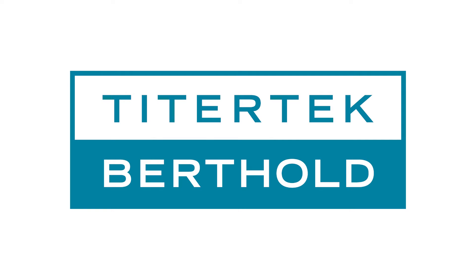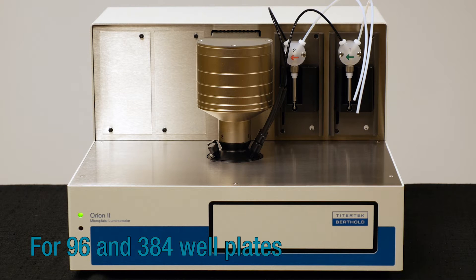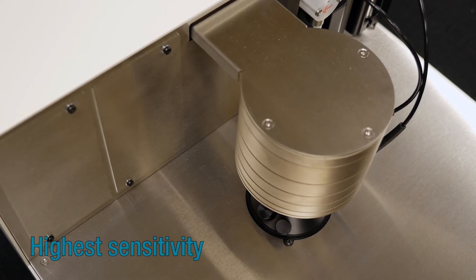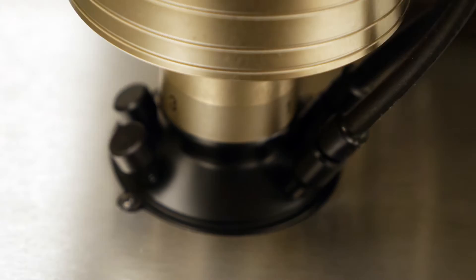Welcome to TiterTech Berthold. This is the Orion II microplate luminometer for 96 and 384 well plates. The instrument features highest sensitivity thanks to high efficient optics and photon counting mode.